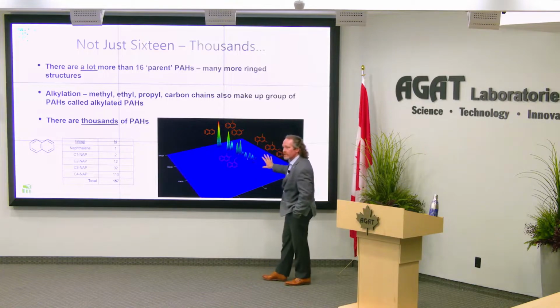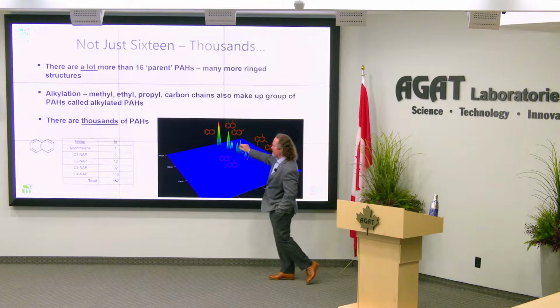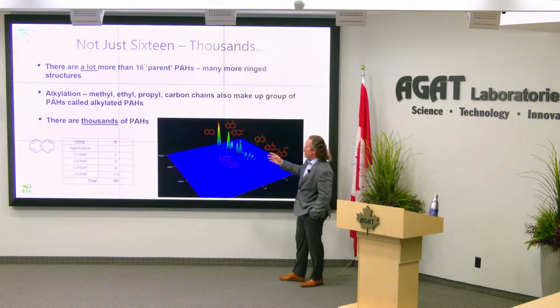This is more of a specialty analysis, where we measure alkylated PAHs in the samples as well. What do we do with alkylated PAHs? Well, first of all, we actually don't measure all of them. We just measure them as groups, and I'm going to talk about that in a second.